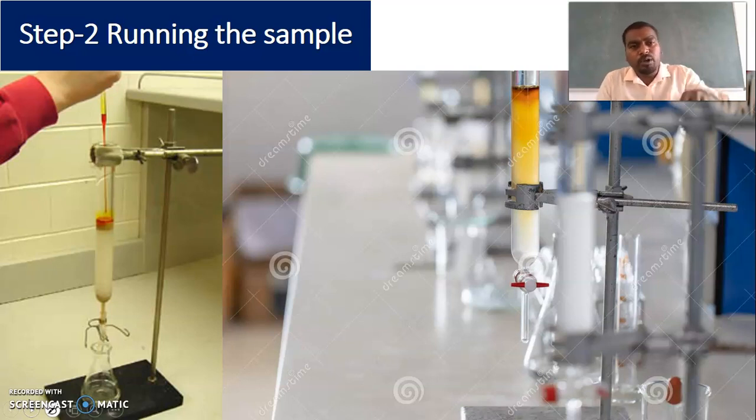After that, we dissolve the given sample in a suitable solvent or mobile phase and introduce it from the top of the chromatographic column.